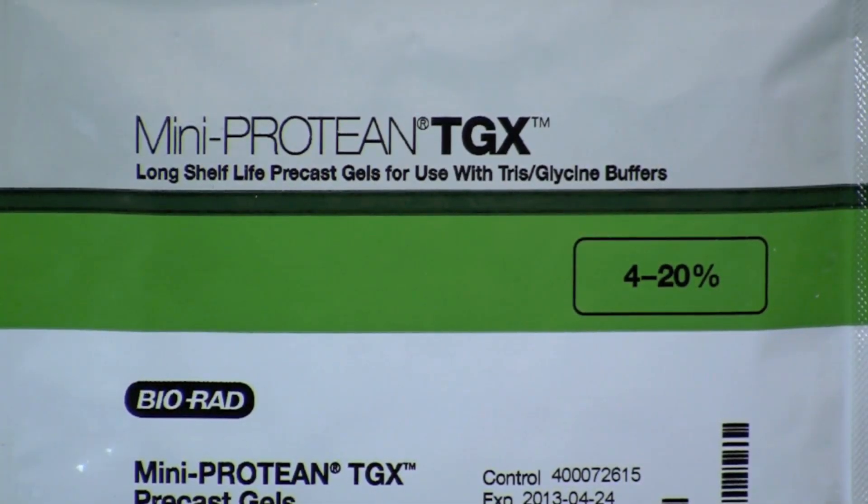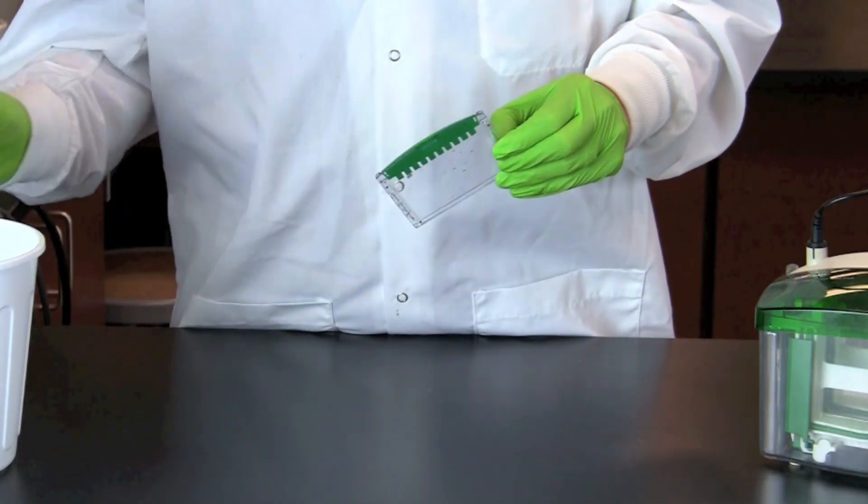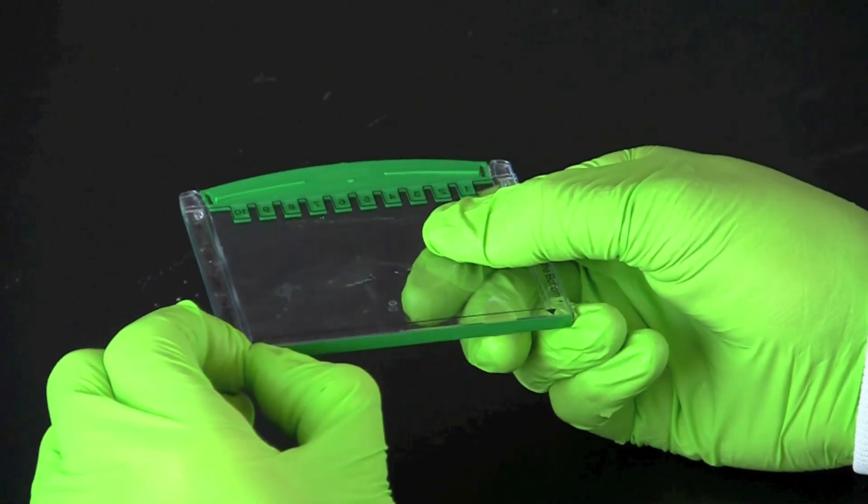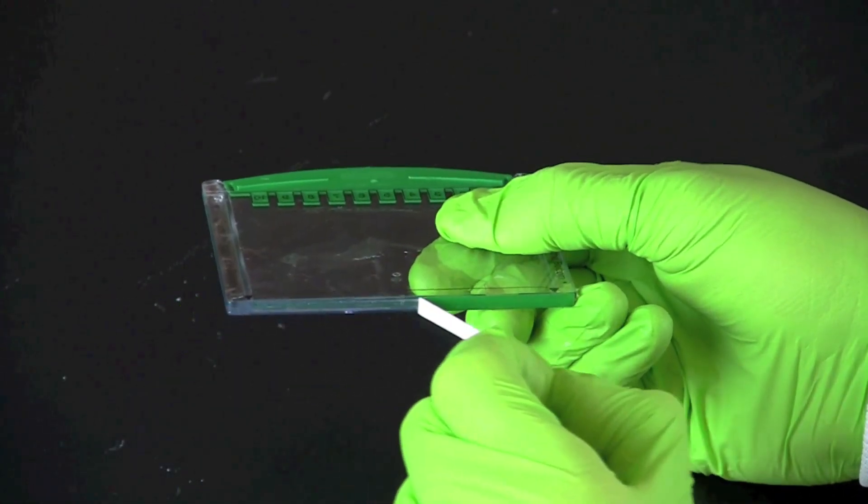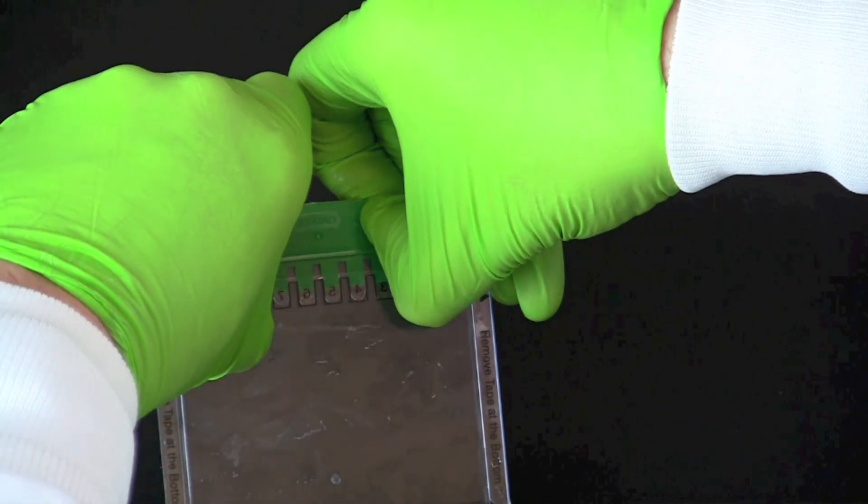Prepare the Mini Protein TGX gel by removing it from its package, pulling the tape off of the bottom of the gel, and removing the comb.